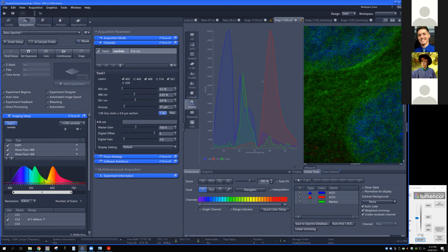How is everybody doing? Does that make sense? Sort of. It's the kind of thing you really need to play with and practice. And it's the kind of thing where good design before you even walk up to the microscope or before you even start labeling your samples can save you a ton of time.